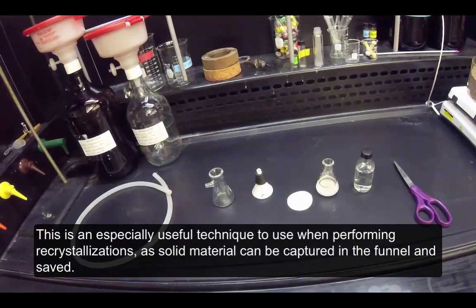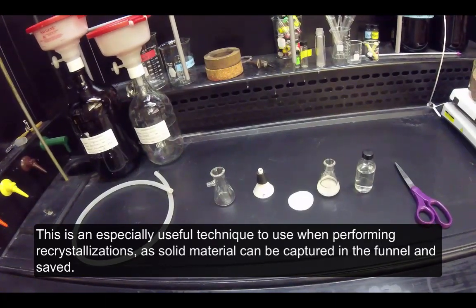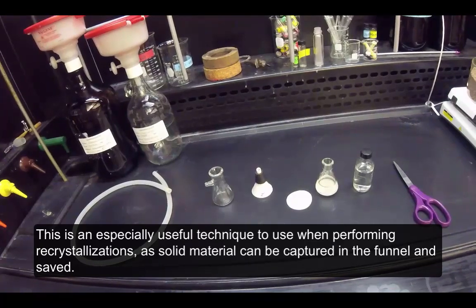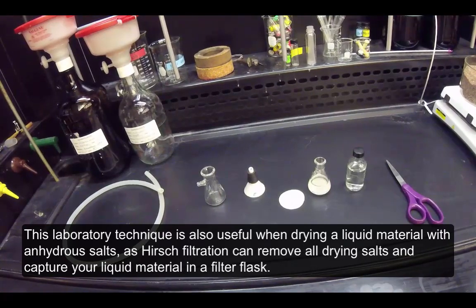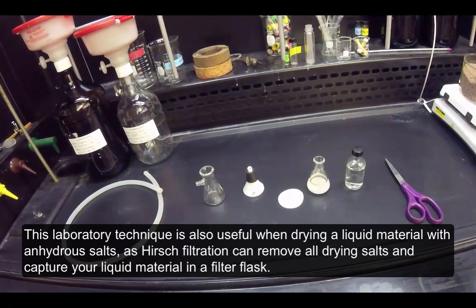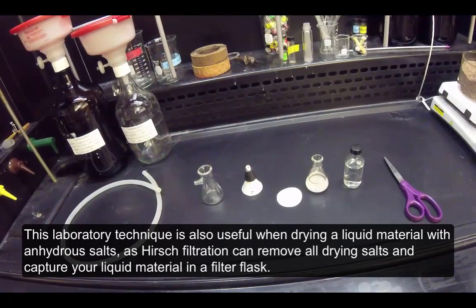This is an especially useful technique when performing recrystallizations, as solid material can be captured in the funnel and saved. This technique is also useful when drying a liquid material with anhydrous salts, as Hirsch filtration can remove all drying salts and capture your liquid material in a filter flask.